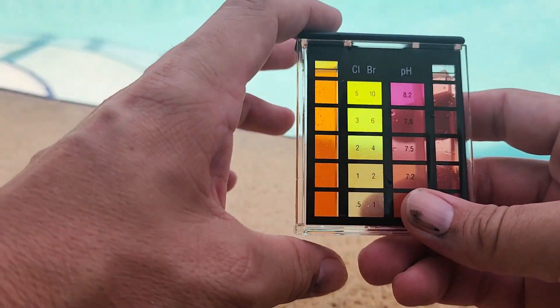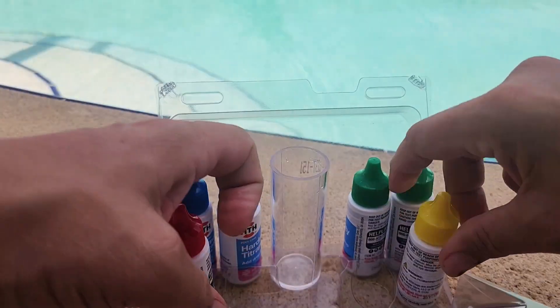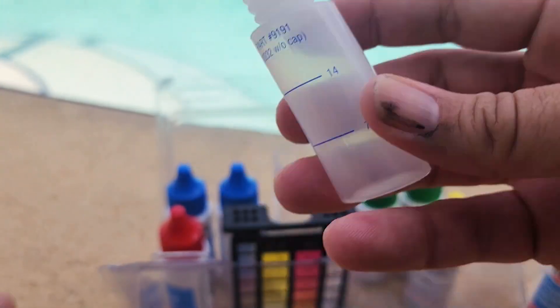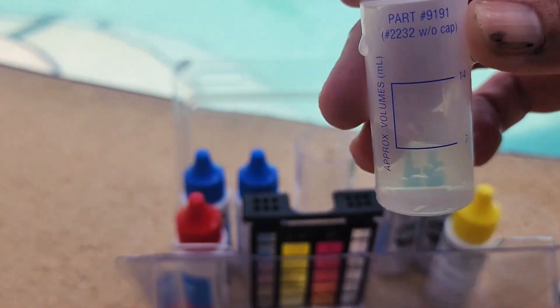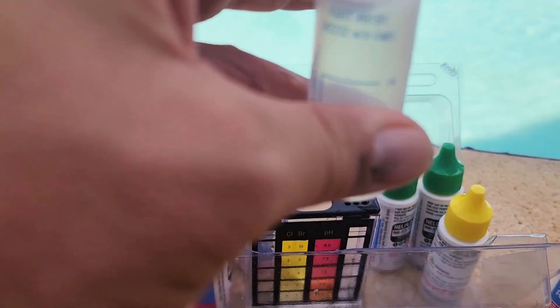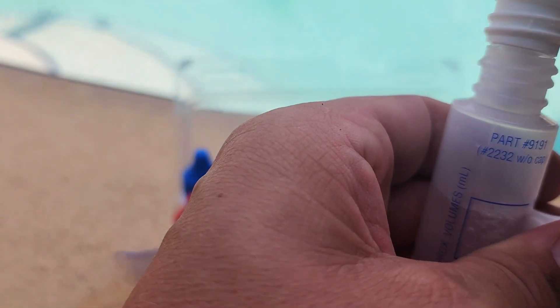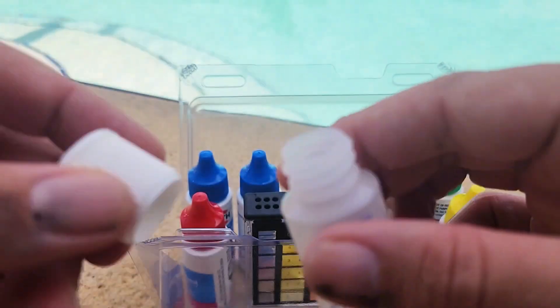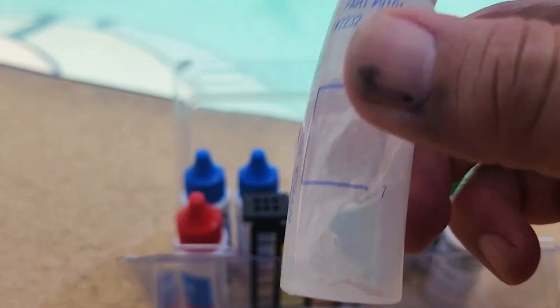The last thing I personally check is my CYA level, or stabilizer level, to see how effective my chlorine currently is. I'm going to take this vial and screw the top off, pour a little bit of water out to get right at the 7 mark. Now that we're at 7, we add the CYA reagent until we get to 14, screw it back on, and shake it for about 30 seconds to mix it up.